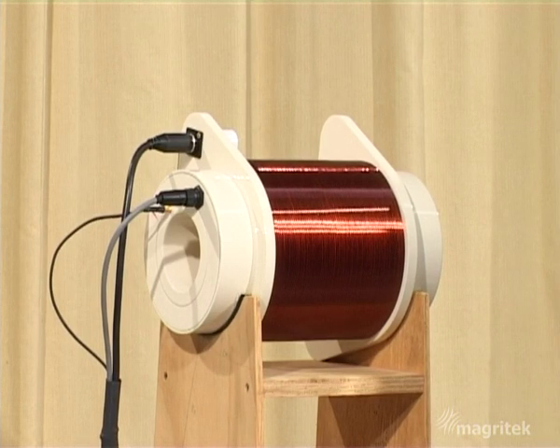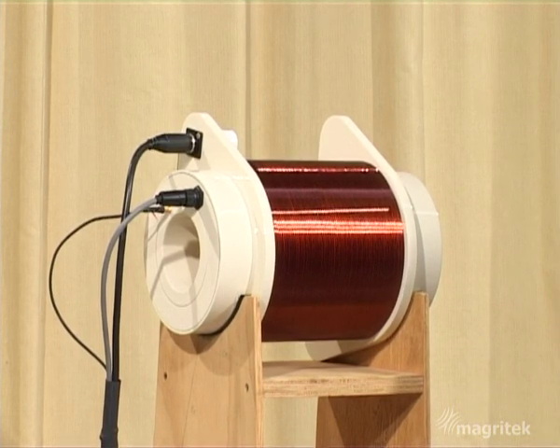Remember the two principles that we need to consider when we're thinking about magnetic resonance. We've got to have a static magnetic field, and that's provided by the Earth's magnetic field, which is about 60 microteslas and leads to a Larmor precession frequency for hydrogen nuclei of just over a couple of kilohertz. And the second thing we need, of course, is that transverse oscillating magnetic field, which is provided, again, by the probe of the Terranova apparatus. Of course, we're going to need a sample, and the sample we're going to use today is water.